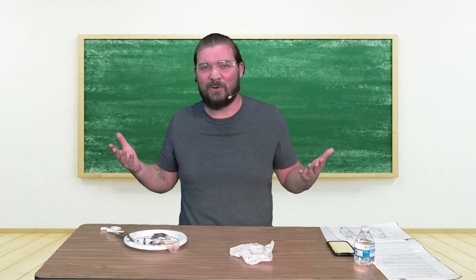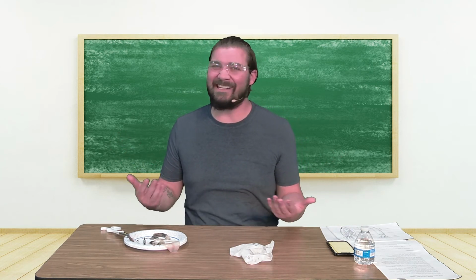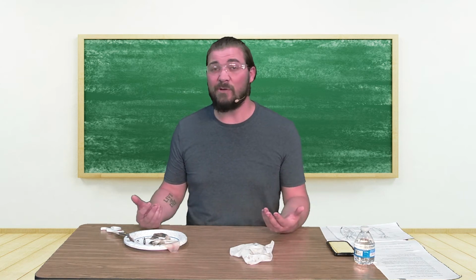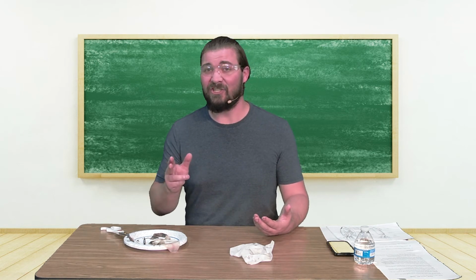So we've dissected a squid. It wasn't that hard. It's a little gross, but once you get into it, it's like anything else. You get relaxed, you get comfortable, and you can learn a lot from stuff like this. Highly suggest cooking it. Don't waste it.